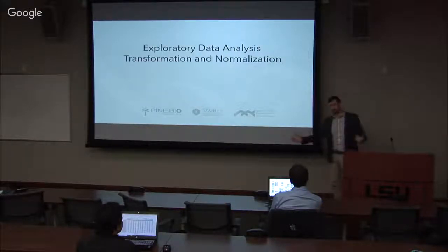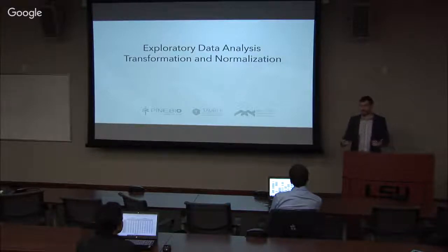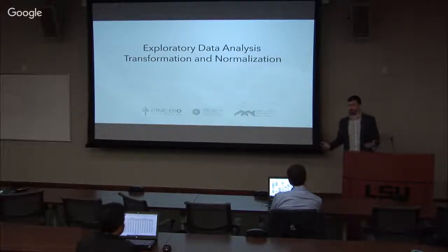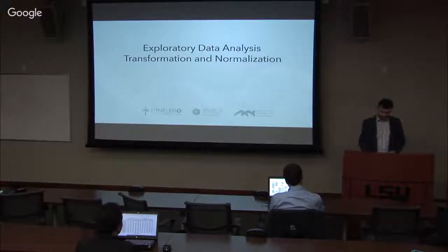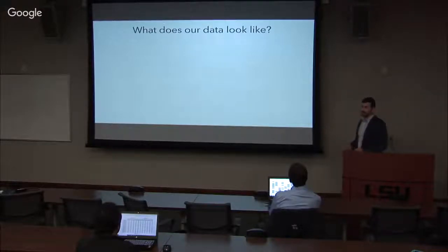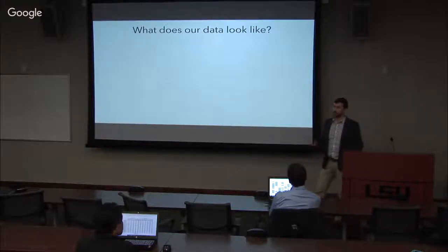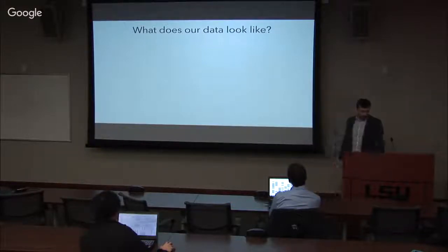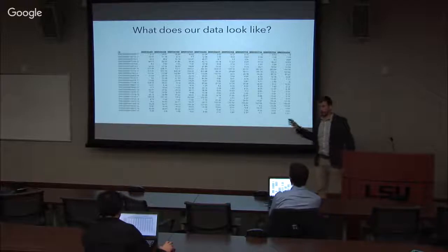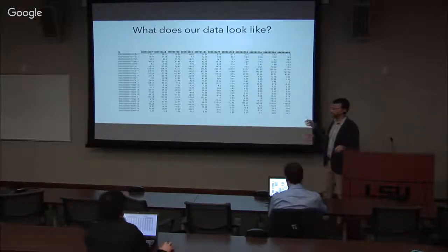So if you have a very long gene, its length is going to affect how many reads could potentially fall on it, right? And how many total reads you have is going to have the same impact. But it turns out that just using that data in certain situations is not going to be normalized enough for us to do subsequent steps. The way we can check that is by taking a look at the table of expression that we got last time. All of you have this data, either from the pipeline that you ran or in the zip file that I sent to you.